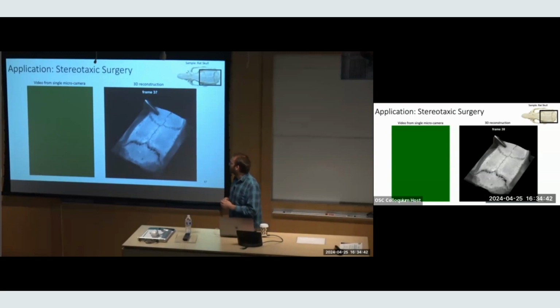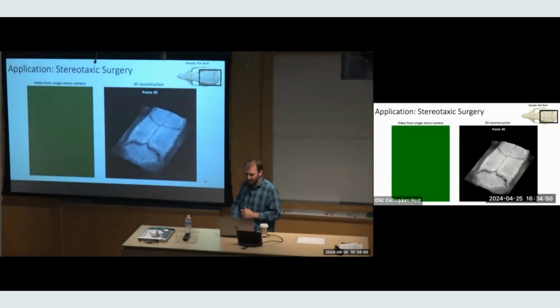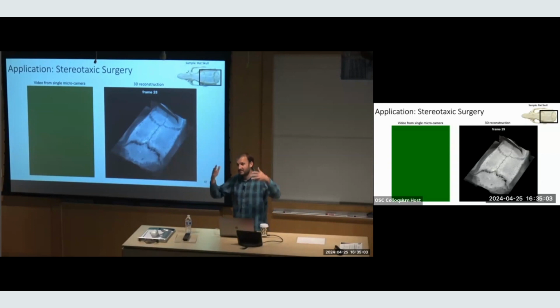And so you can see, you were speaking about occlusions, I think. You can see we can't solve that problem with this design yet either, or not naively. Sorry, let me play that again. You can see beneath the tool, we're not able to fill that in because we don't have enough perspective views to capture that.